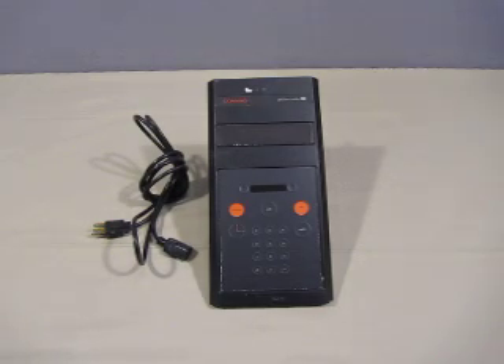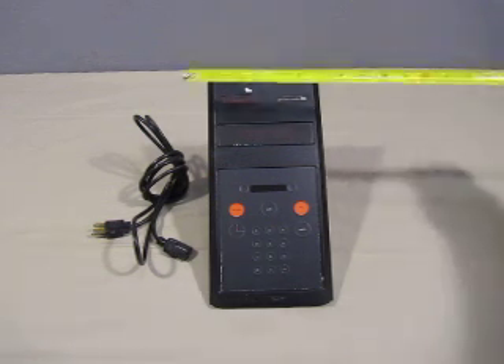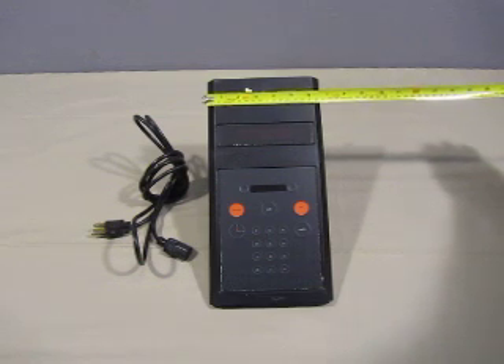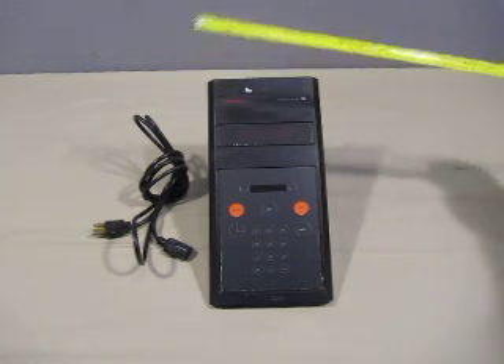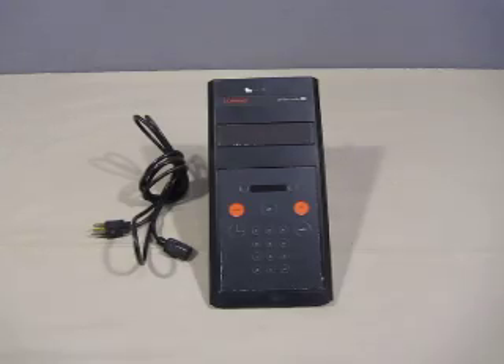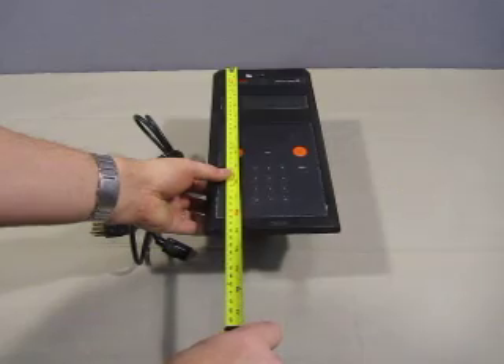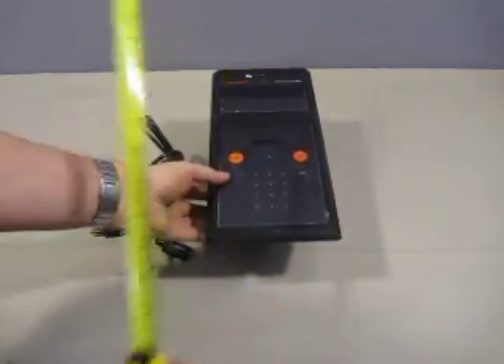Up for auction we have one Corning PH Ionmeter 150. It measures approximately 6 and 5/8 inches, or 17 centimeters, in width and 13 inches, or 33 centimeters, in length.